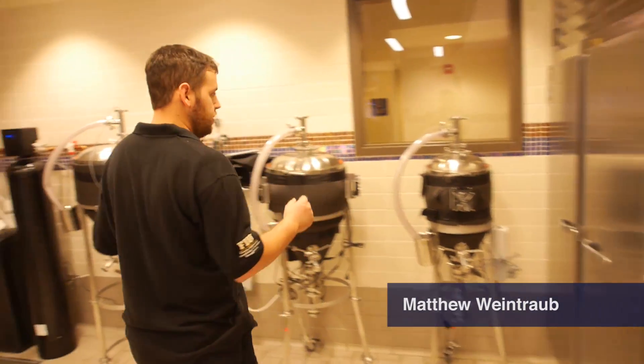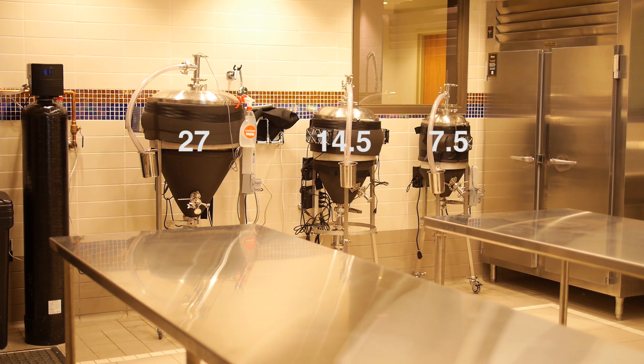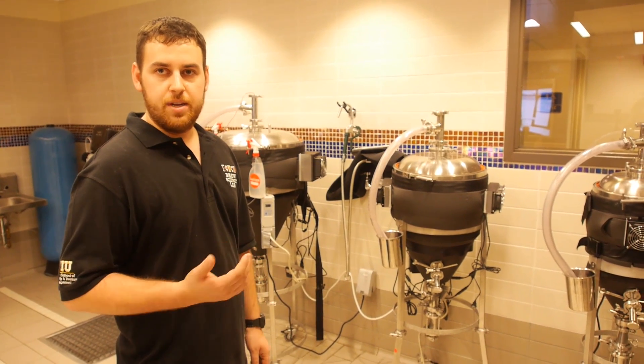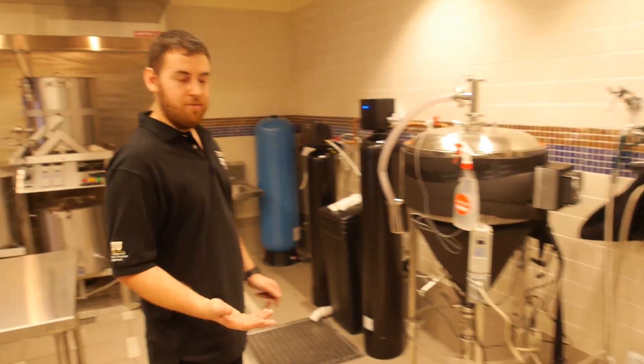Over here are our three fermenters. We have a 7.5, a 14.5, and a 27 gallon conical fermenter where we can control the temperature within half a degree. That's really awesome compared to what we had before.